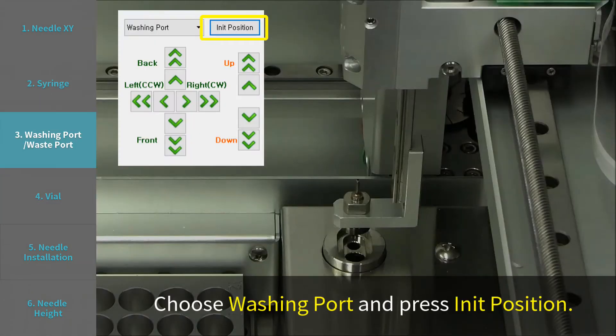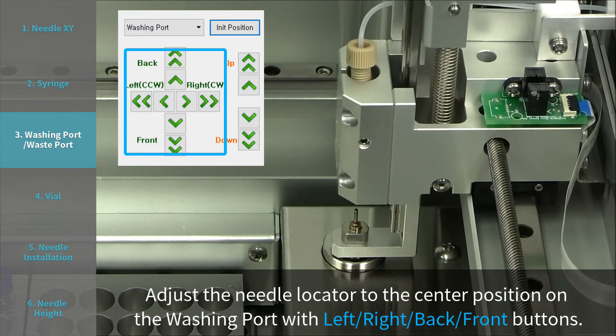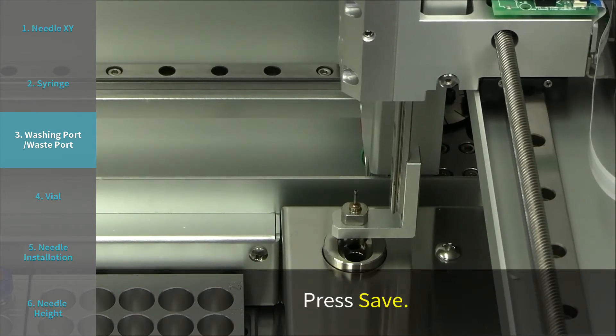Step 3: Washing port and waste port. Choose washing port and press INIT position. Adjust the needle locator to the center position on the washing port with left, right, back, and front buttons. Press save.